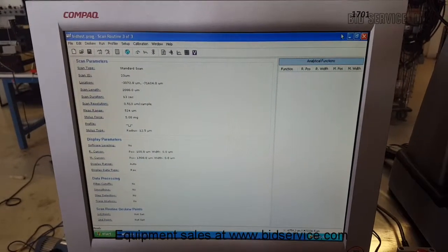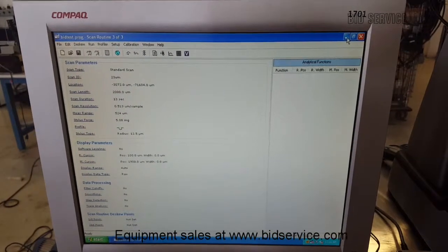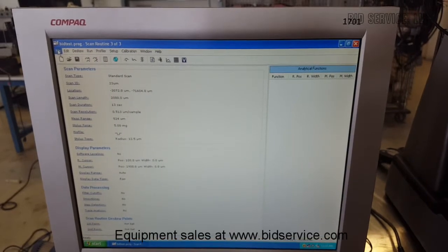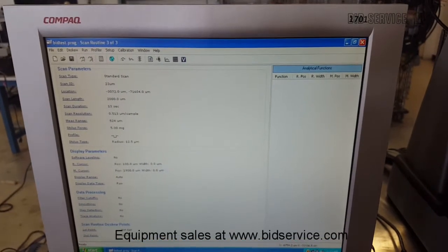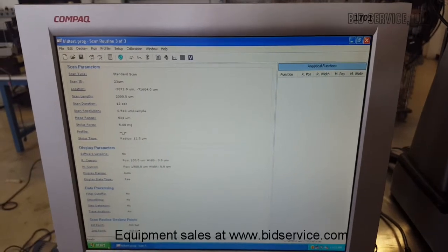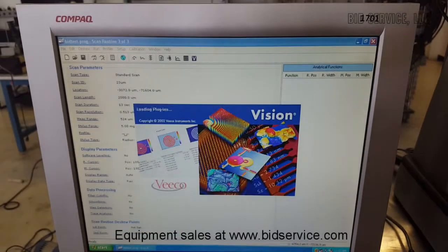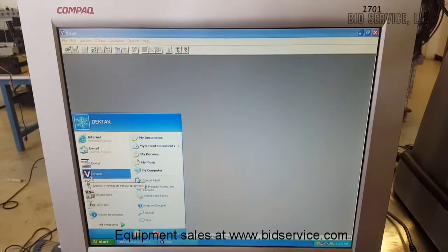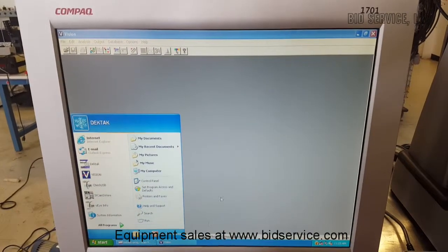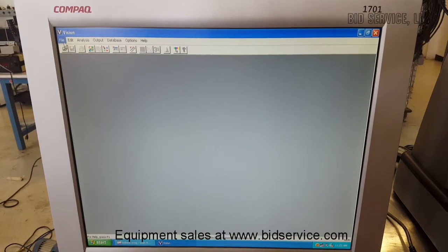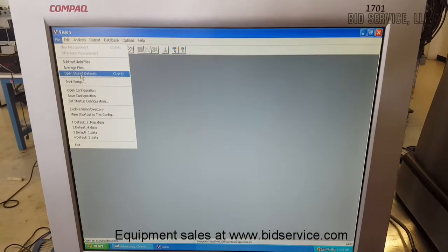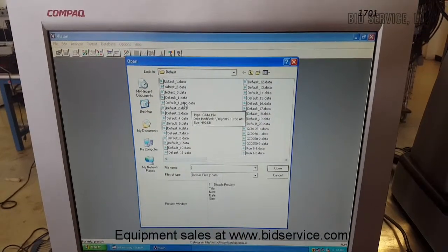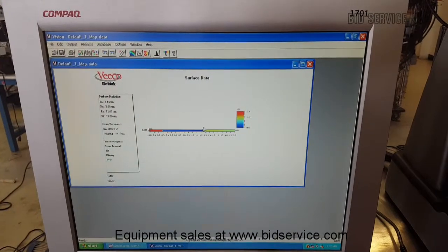This system also has a 3D mapping option. It's a long test, so I ran the scan previously. After you do a 3D map, you would go back into the start screen and open the vision software. Once the vision software is open, you would go to file and then open stored data set — and this was where I saved that data set.